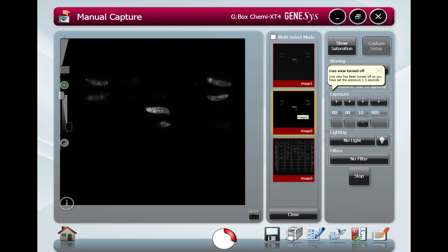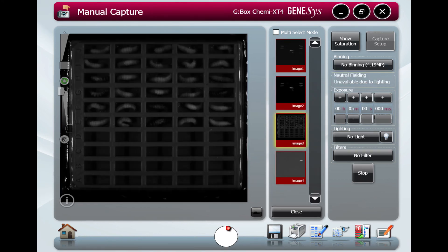It is important that after taking the bioluminescence images you take a bright field image of your plates before you move it. This is necessary for image analysis. Here you can see the bright field image. You will now have at least two images: a bioluminescence image and a bright field image. The bioluminescence image needs to be overlaid on the bright field for well detection.